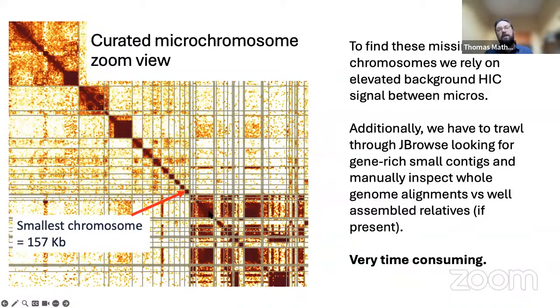And you can see here, these other ones which are below this last chromosome, you see this darker signal on these contigs. These are hitting multiple contigs across the assembly, and these are probably repeat sequence. You can differentiate the repeat sequence from these microchromosome contigs by the lack of this Hi-C background signal.